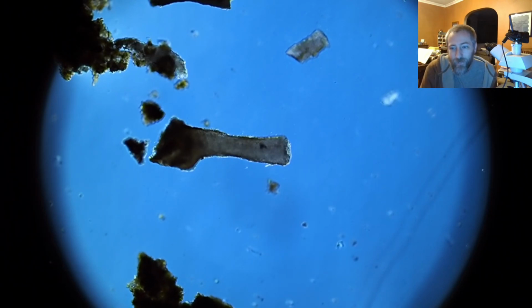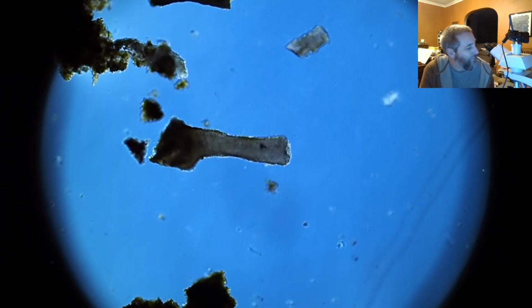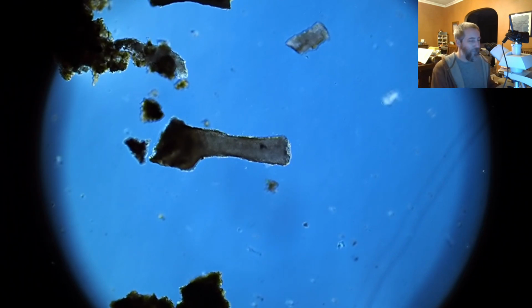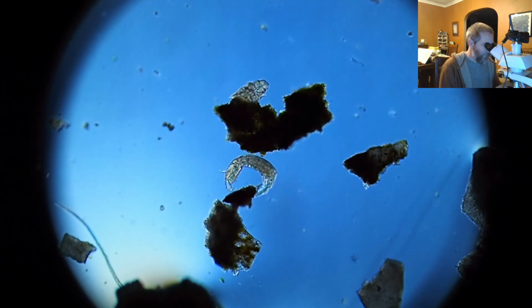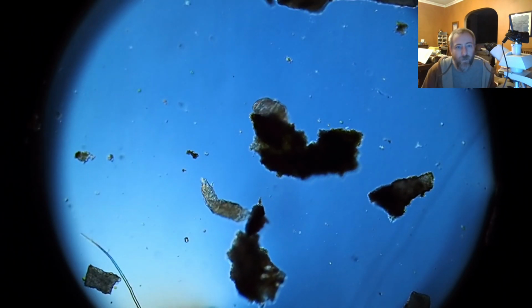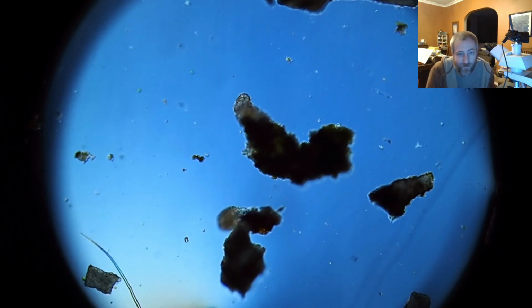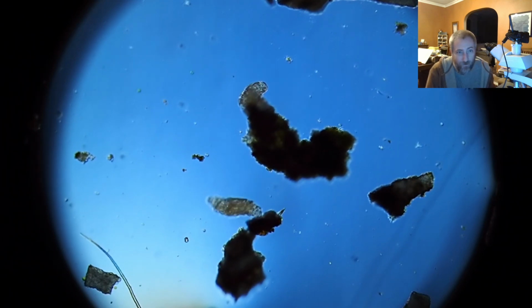Hey, Mama Bonbon, if you're going to add water to it, that you don't add tap water that's been chlorinated, because I think chlorination probably would kill both the rotifers and the water bear. Maybe not right away, but I think they probably would not manage it very well. So there's this little combination rotifer water bear right there for you, and then just wait 30 seconds and put a sample on a microscope slide, and that's it.